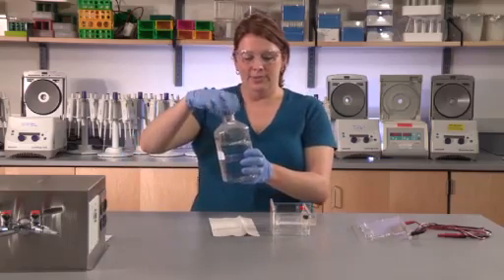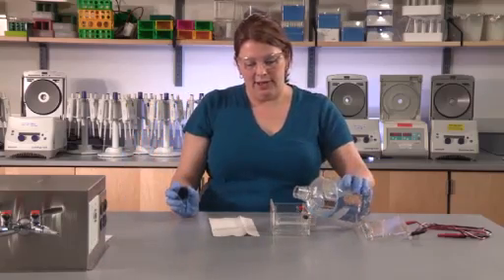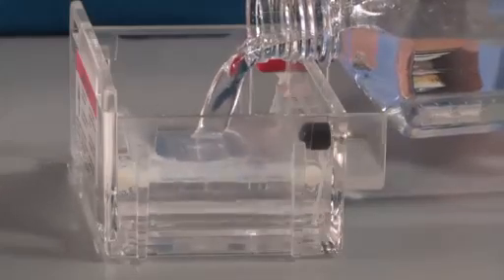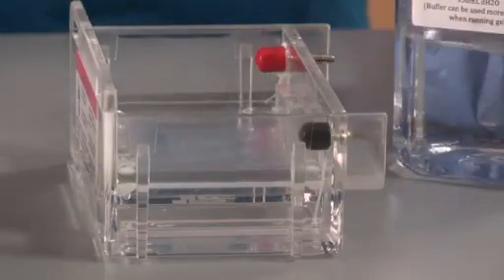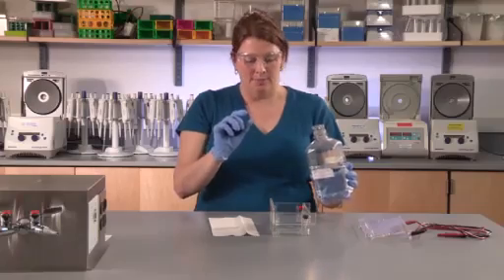Take the gel running buffer and fill the electrophoresis tank, being certain that you cover the top of the gel and have the wells submerged. A good height is at least three to five millimeters above the gel bed.